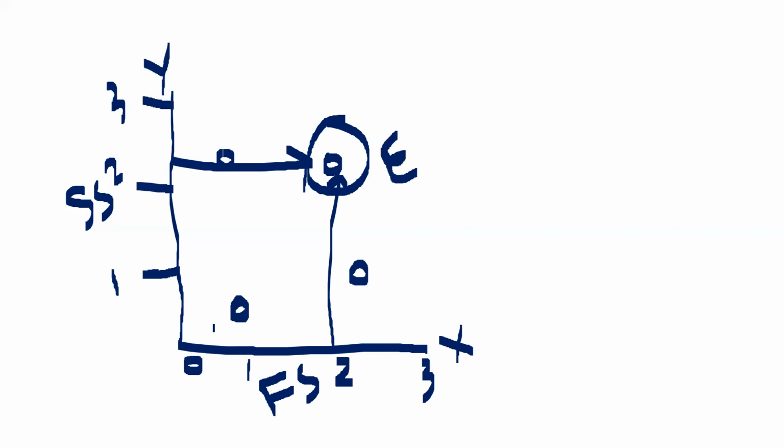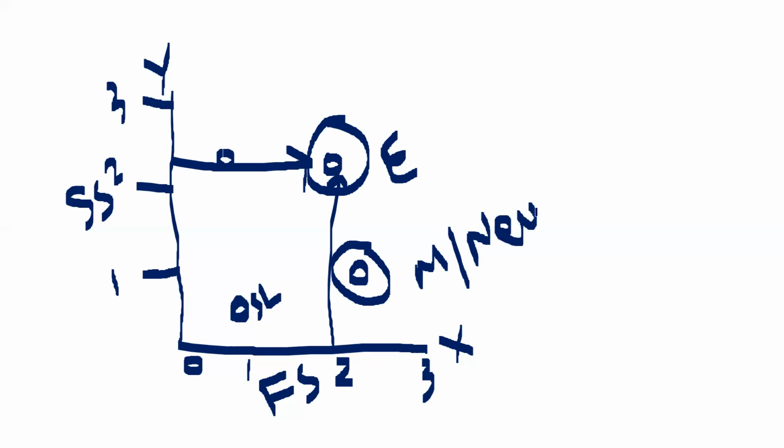This is a small cell and agranulated. It might be a small lymphocyte. And here, semi-granulated, less granulated but big cell. So less granulated big cell, it might be of two types. It can be either monocyte or, actually, there are minor granules, so it cannot be monocyte. It might also be a neutrophil. So we need further confirmation with other techniques.